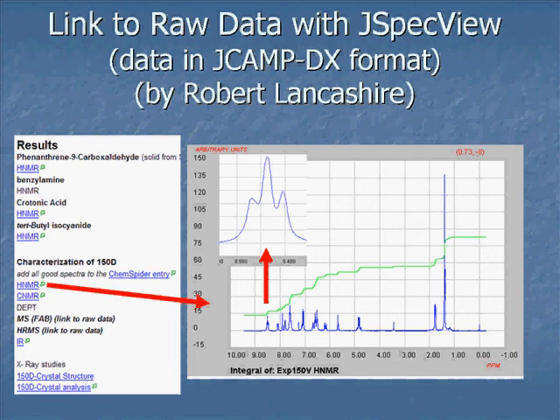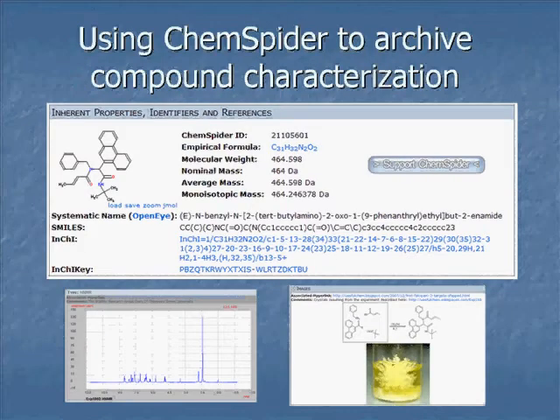And also, you notice the spectrum, it's kind of hard to tell what's going on, right? I know that sometimes you see the supplementary sections in papers and you wish that you could expand to see if there's a rotamer or some kind of impurity there. And here anyone can do that. It's totally open. And ChemSpider, I'm going to revisit ChemSpider a couple of times. It can do some very useful things.